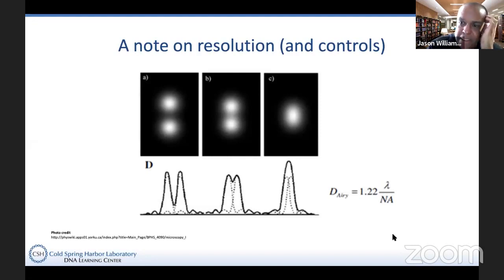You probably think about resolution from optics. Resolution in optics is, if I have two different things, can I tell that they're two different things? If I have two different peaks, at a certain resolution, they look like two distinct blobs. But if I don't have good resolution, then they look like one thing when they're actually two things. That's an analogy you might think about. What's the resolution of a barcode? Well, a barcode might actually look very similar for two closely related species, even when they're different species. And so you may need more data to tell them apart.